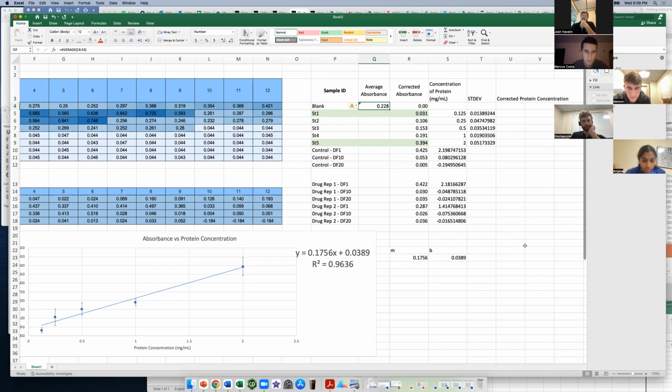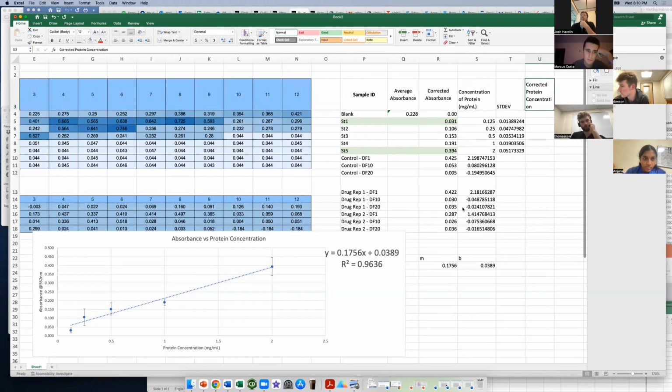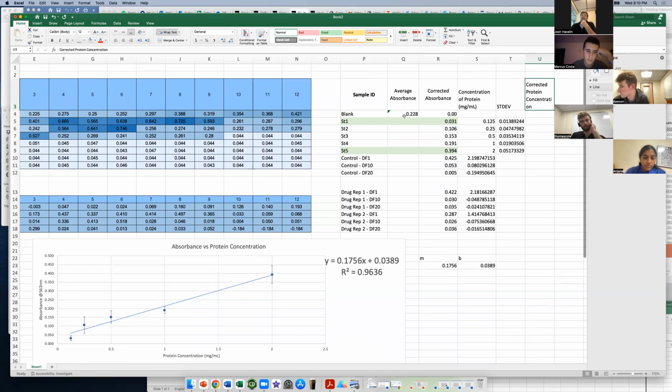Would that have to do with approaching catalytic perfection? Nope. It's more mathematical than that. So like it wouldn't have anything to do with kcat or km? Nope. It's an outcome of the linear standard curve we built. Is this the thing where there's a range of numbers that it has to be between? I think it was like 2 to 5 or something like that. I don't know the exact numbers, but yeah.